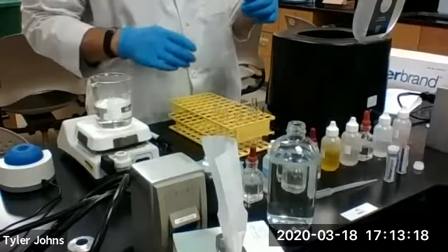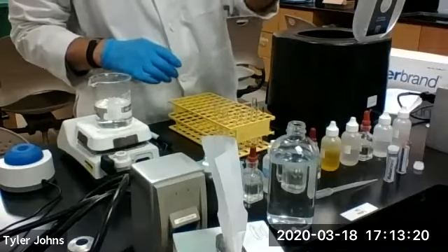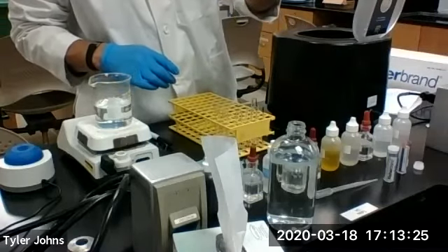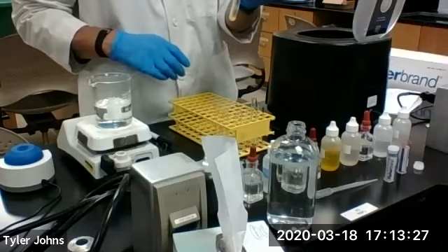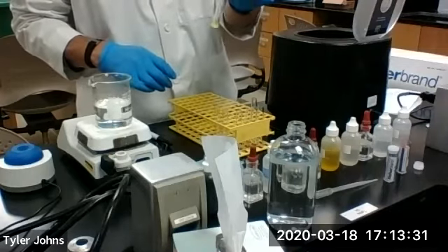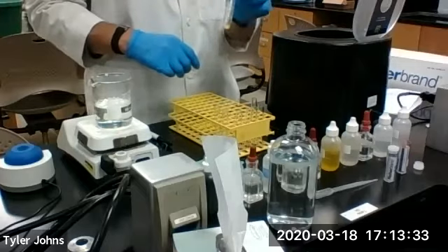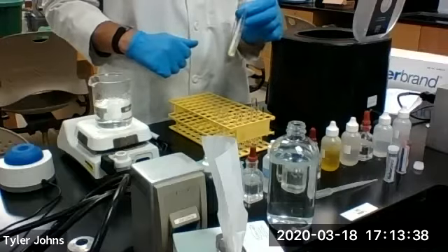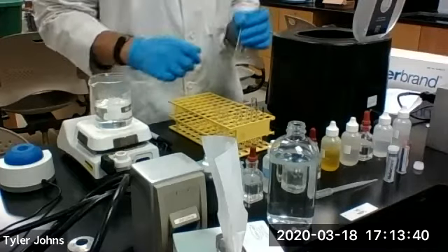Okay, now we're going to take the barium chromate, which is residue 15, and we're going to do a confirmation test of the barium ion. To residue 15, we're going to add 2 or 3 drops of 6 molar HCl.